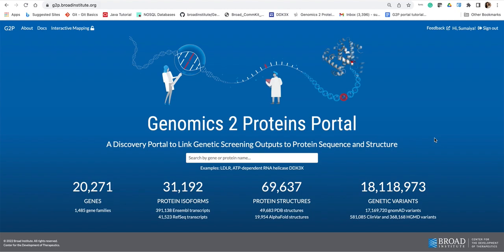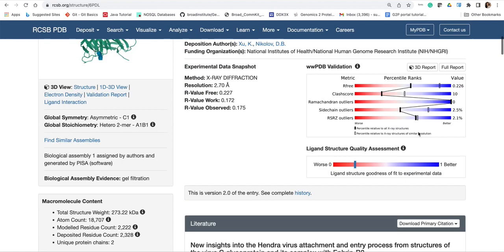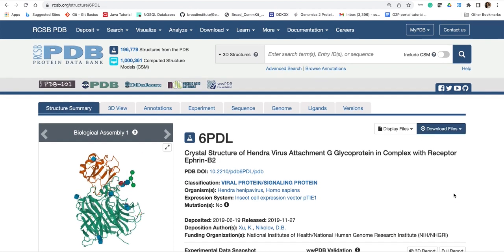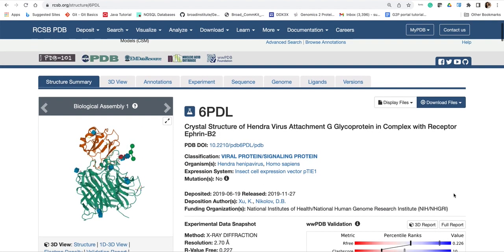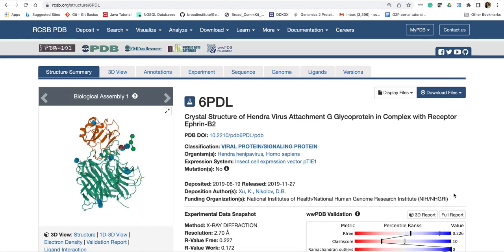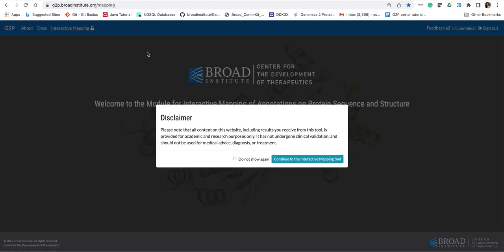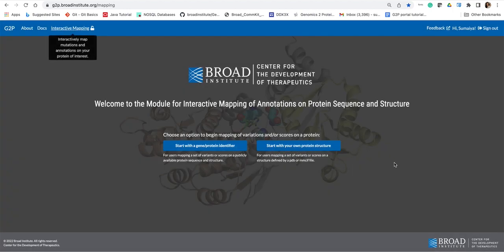I will analyze the structure of Hendra virus glycoprotein bound to the human receptor ephrin-B2. So let's go in and click on the interactive mapping module of the portal.